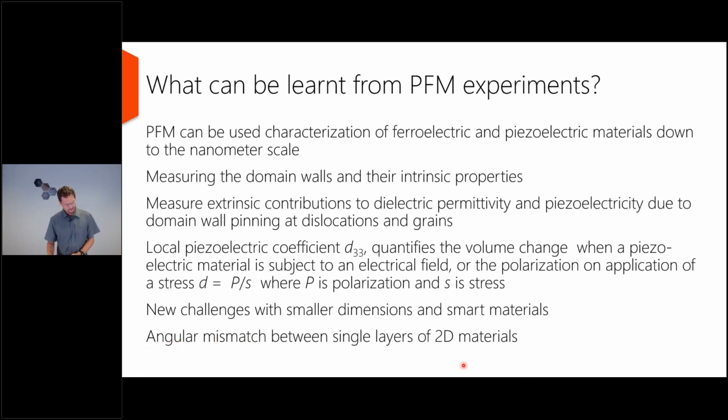A very recent application of the PFM imaging mode is to study the angular mismatch between single layers of 2D materials. If they are not exactly matching, you'll get a moire pattern, and this can be made visible using the PFM imaging mode.